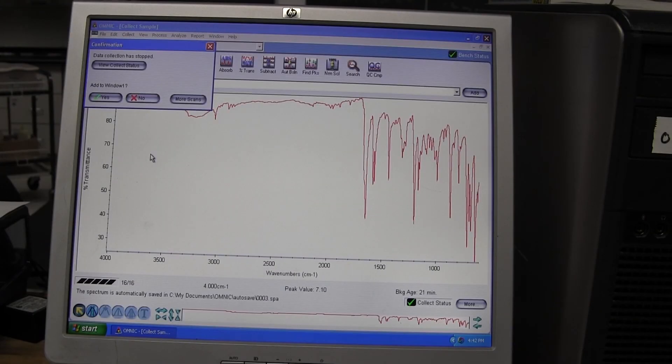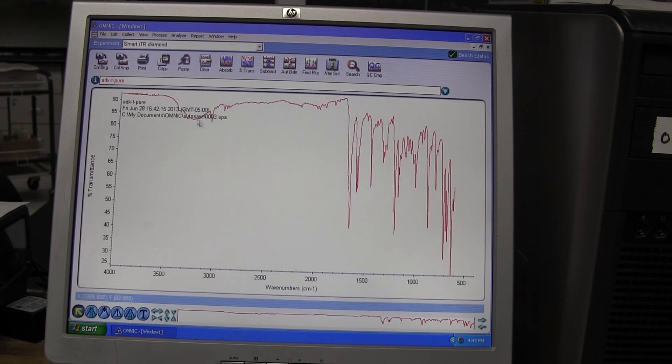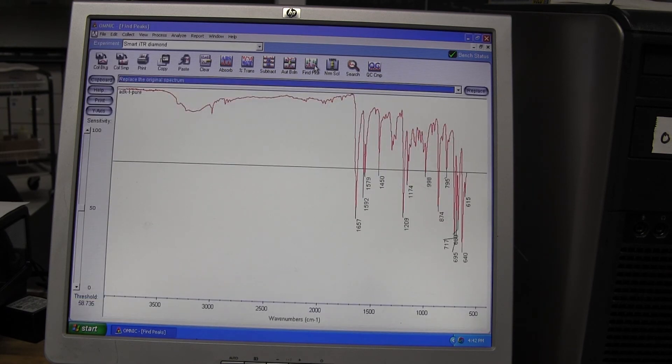A new window will inform you when the data is collected. When it asks you if you want to add your sample to a new window, click Yes and take mental note of which window it will be added to.